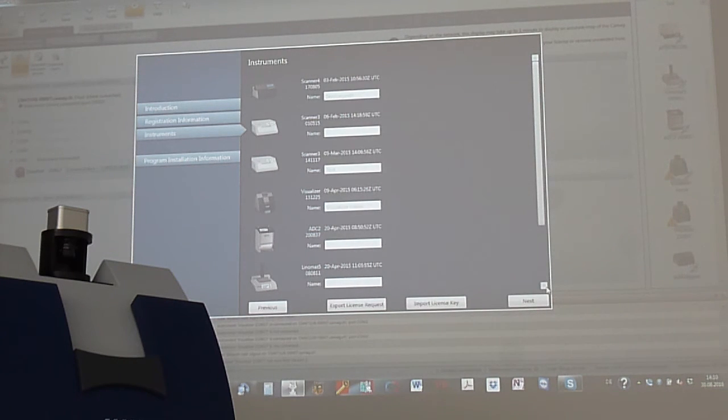This is 2.2, but the reason I was looking here is I wanted to check the second visualizer, and I can see the second visualizer. How are these icons not active? There's nothing active here, just previous and next. This is strange.